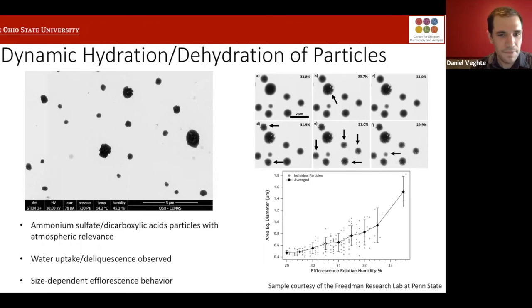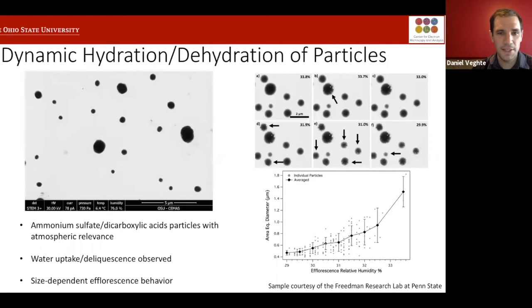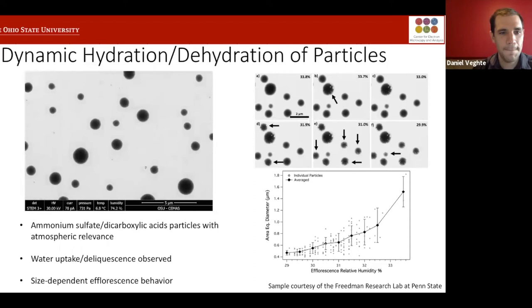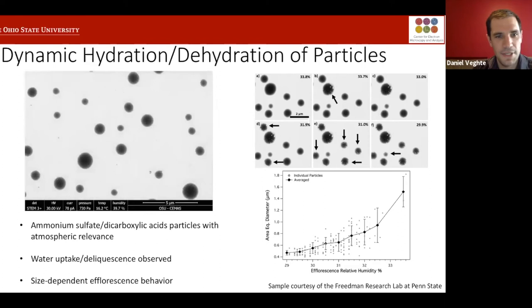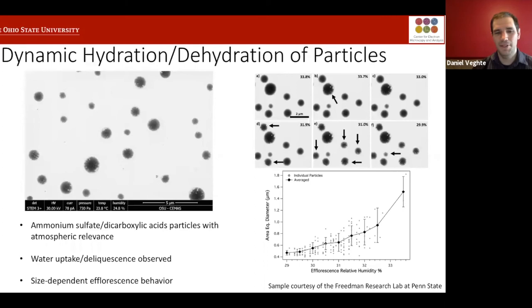The other cool thing is that during this entire time, you're taking a video. So I'm going to play this video. What you can see is, as we increase the humidity, the particles uptake water. Then you can see it fully deliquesces and grows a little bit more. Then I move to a different part of it and start lowering the humidity. We're at about 60%. Just keep decreasing humidity. As soon as we get around 35%, you'll see it quickly starting to effloresce. All these videos are sped up quite a bit so that it only takes about 30 seconds, whereas the experiments themselves take probably a few hours to run.